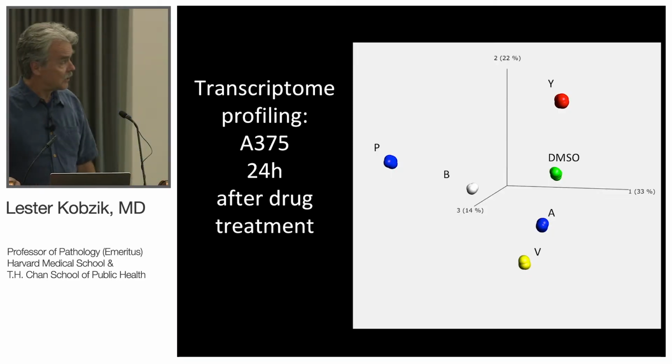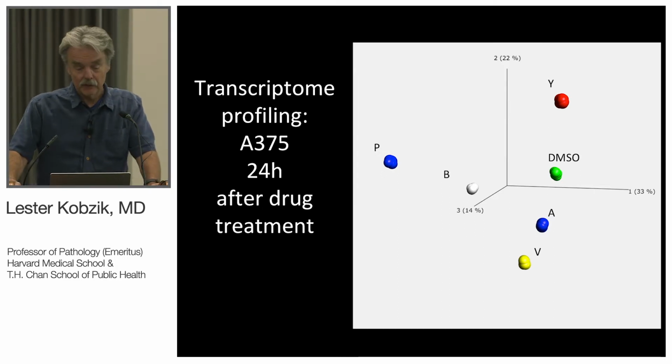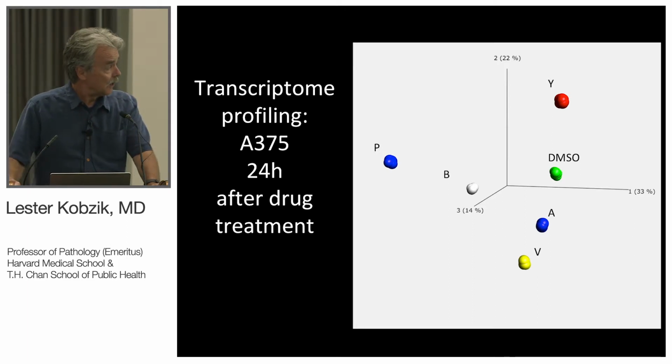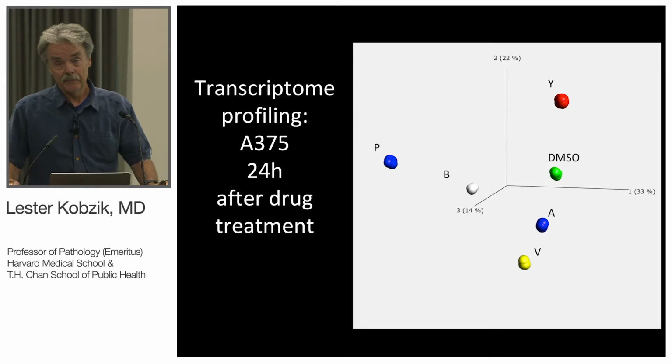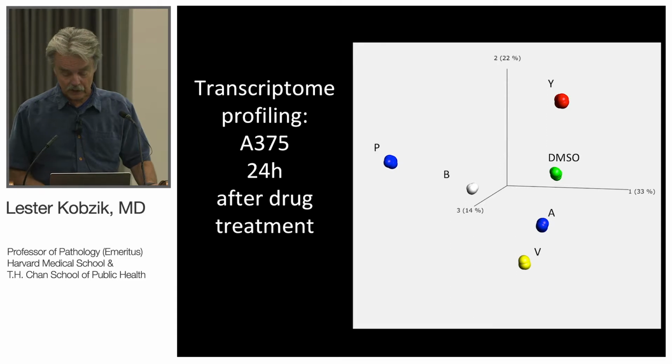We were able to cluster the compounds using PCA, and the main message from this kind of analysis is that we have very good separation from our control, the DMSO in green, of all the compounds. They're different from each other, and all the replicates, there were 4 replicates, each clustering together almost like one of these molecule models, very closely and tight, showing that the technical replication is very satisfactory.